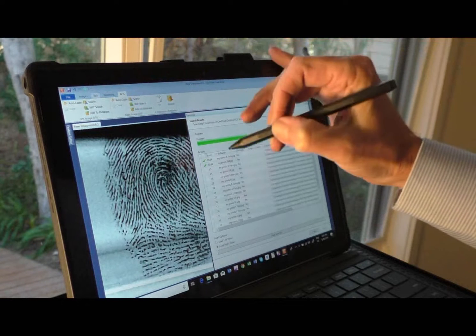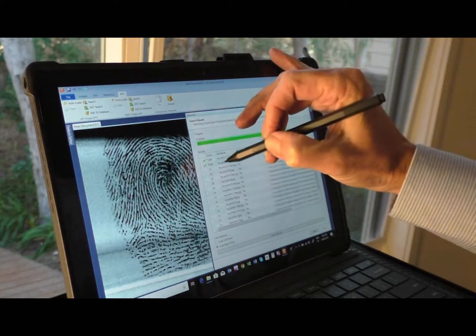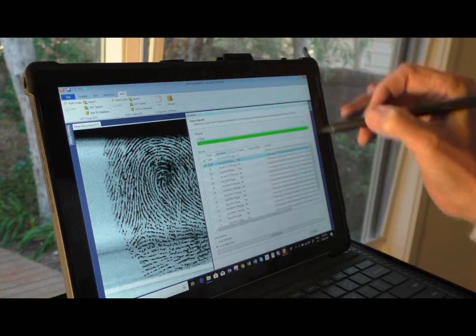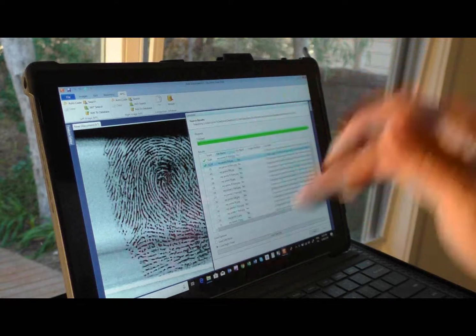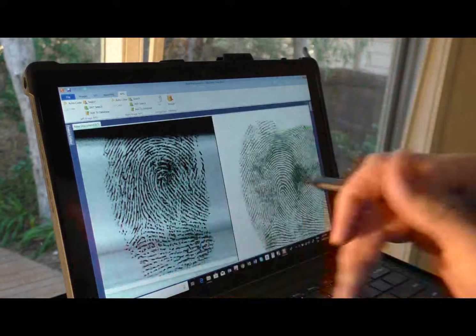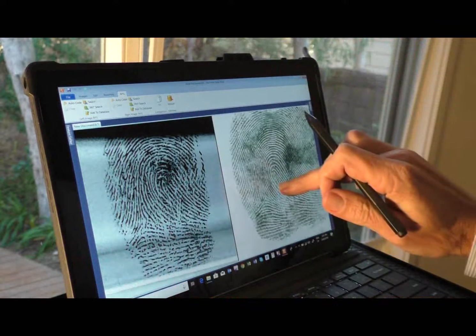Our result is very fast and the matching candidate is viewed by double clicking the record. The image automatically loads to the right screen.